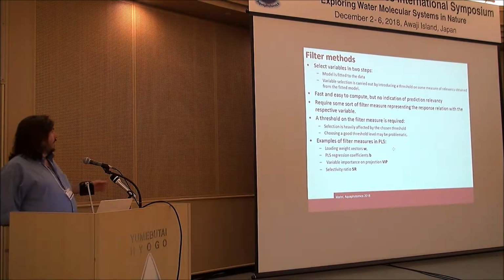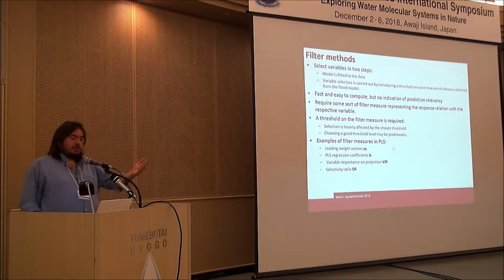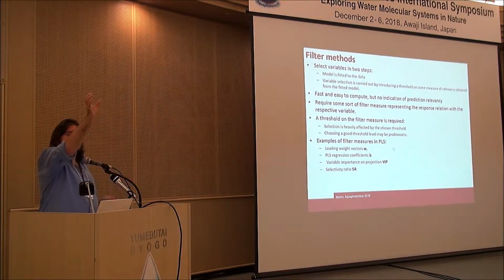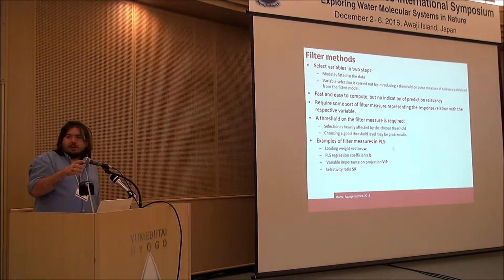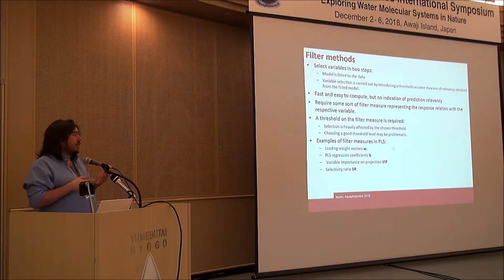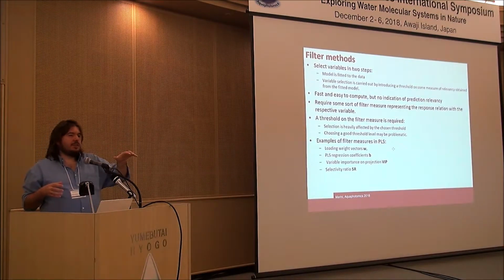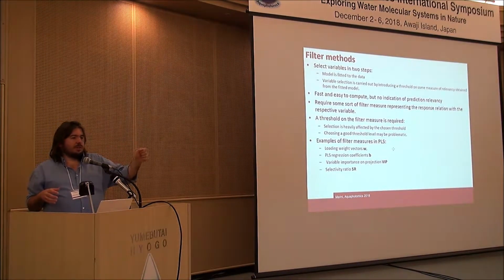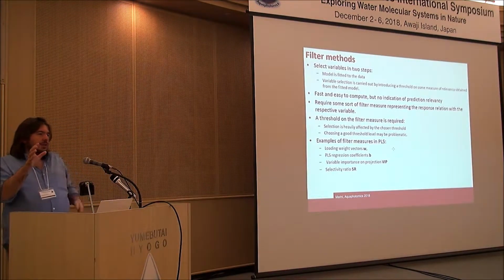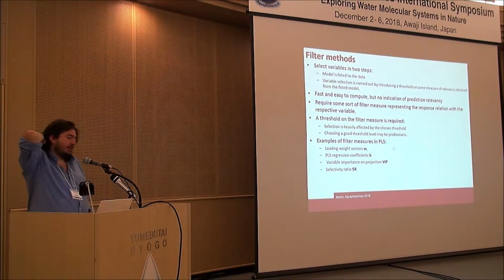The idea is that filter methods are something we do also when we consider regression coefficients and base our interpretation and identification of bands on the values of coefficients, loadings, and so on. Because we just calculate our model and use the model parameters as a filter, in the real sense, to define which variables contributing to the model may be relevant to the definition of the model itself.